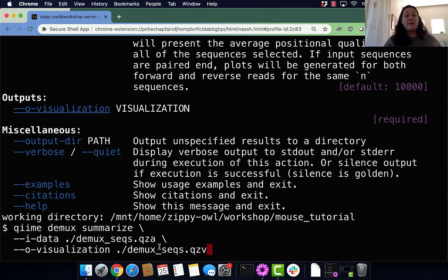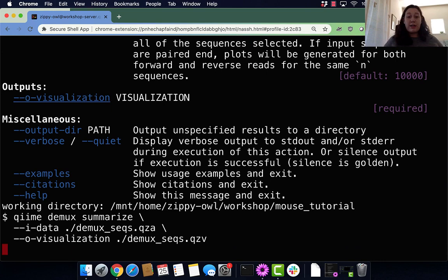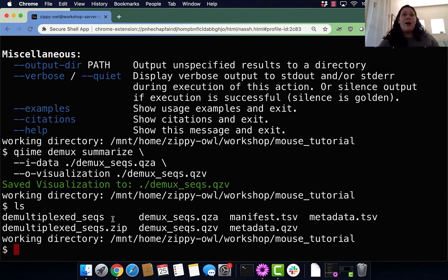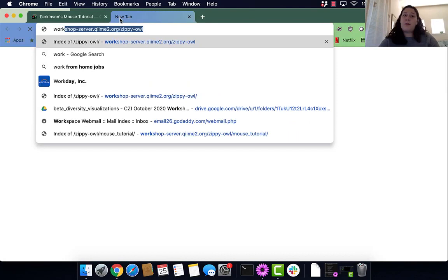We have an input of our data, demux_seqs.qza, and then a visualization called demux_seqs.qzv. I am running that, and that should visualize our demux_seqs.qza into a visualization. As you can see, we have our visualization. Ls and we can see our visualization in our directory.